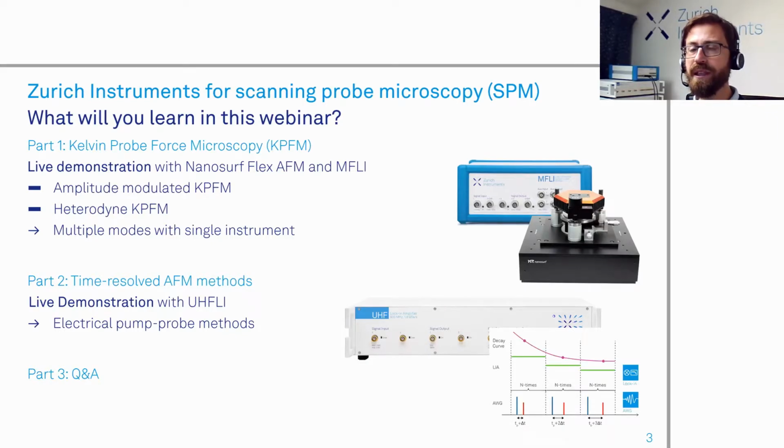I'm actually very excited to present you this new content because so far we could only show how it works in principle, but we understand that sometimes the devil lies in the details, and so hopefully you'll get a better feel how this works. For the purpose of this demonstration, we'll use an MFLI for the KPFM part, along with the NanoSurf FlexAFM and a UHF-LI for the electrical pump probe, as you see here.